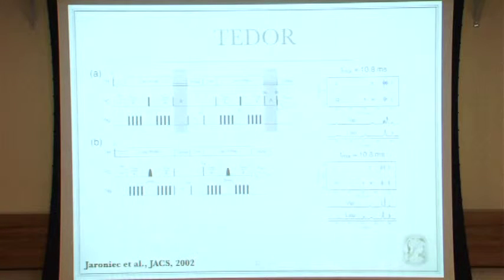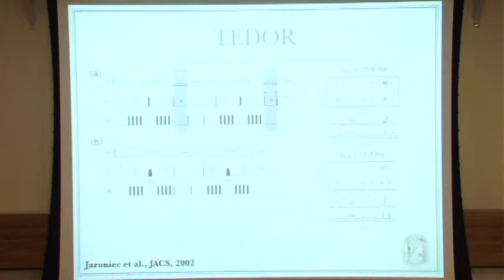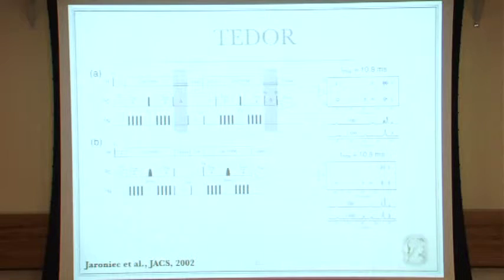To solve this problem, Christopher introduced these delays here. You can see here in red, this artifact is because of the scalar coupling. And by applying this pulse sequence, we decreased these artifacts. This is quite nice because here we have a small peptide, but in general we have huge molecules, and you can imagine how crowded the spectrum will be. And with this artifact, it could be really worse.